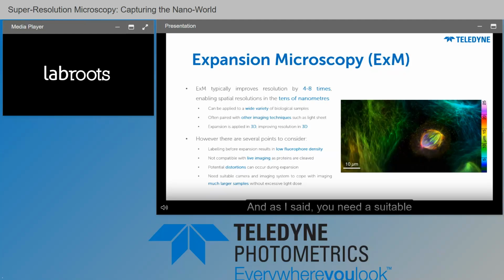And as I said, you need a suitable imaging system to cope with imaging much larger samples and a suitable camera to avoid lots of tiling and scanning and excessive light dose that comes with that. You just need a big, fast, large field of view camera.